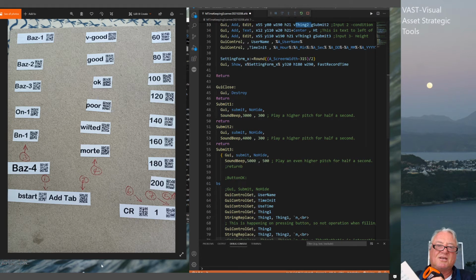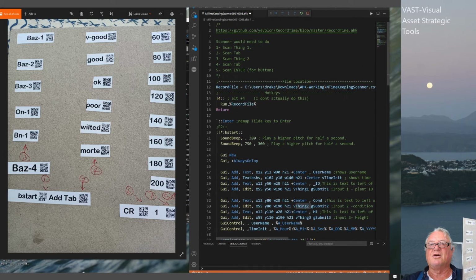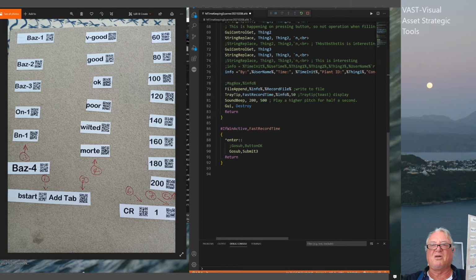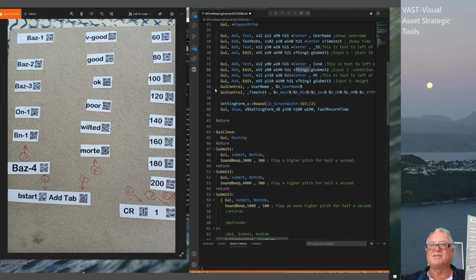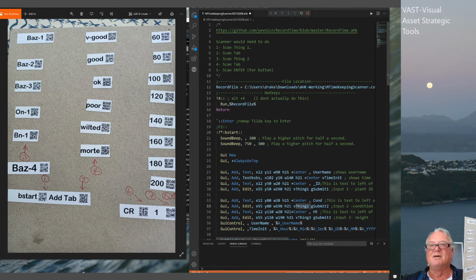So this is why I've got the program up here, just so that you can see what the code looks like. It's not particularly long code, but there's 92 rows of it, so not much, and there's a little bit of annotation. So it's putting it into a separate file. So the next part, I've got a 10 millimeter high QR code there, so less than 1/2 inch, and they accurately work through here.